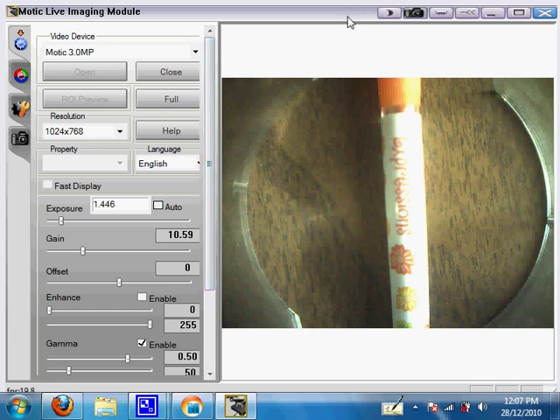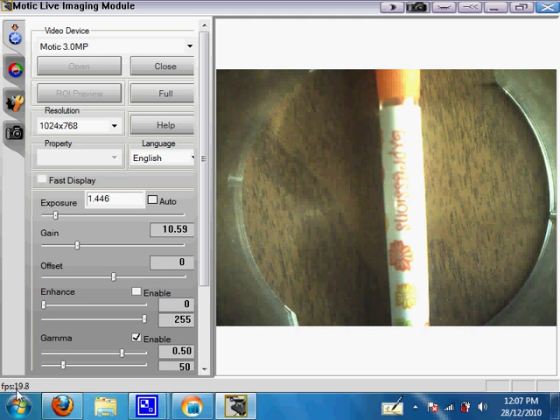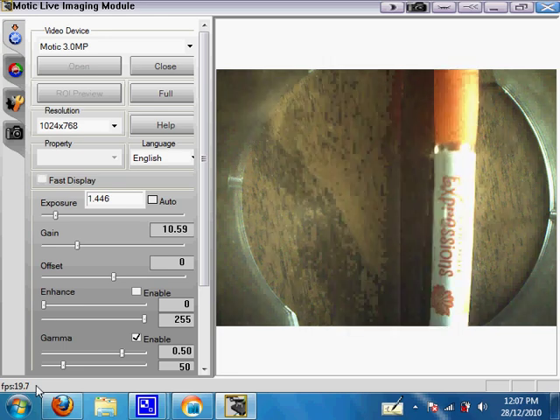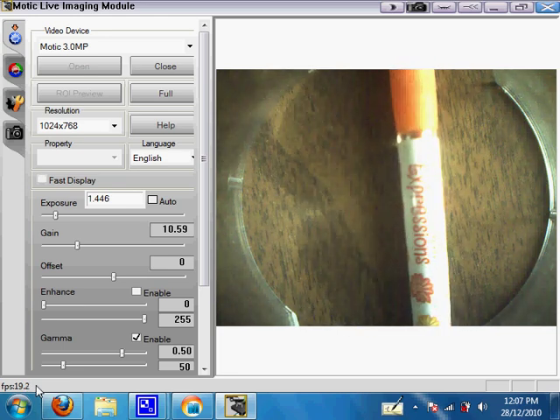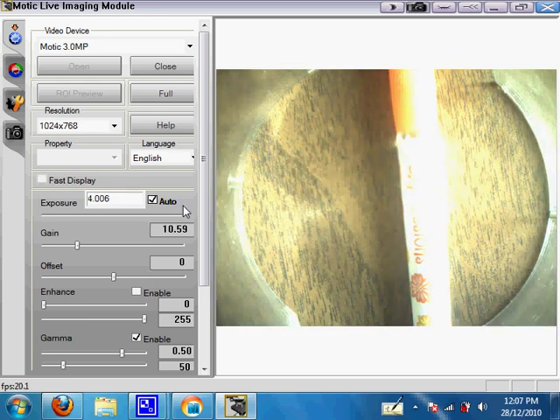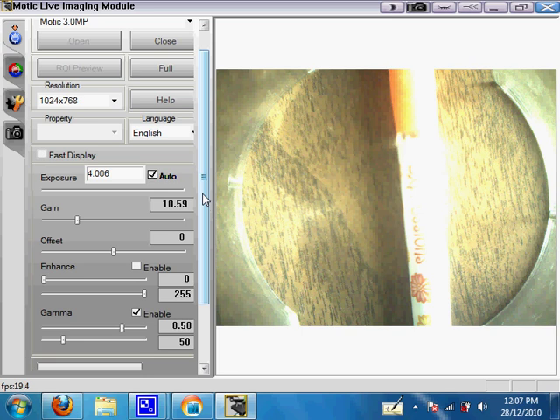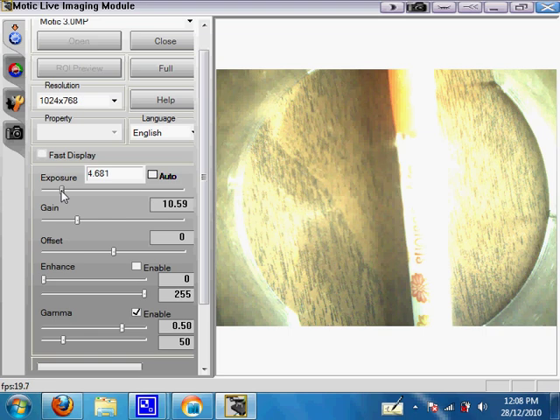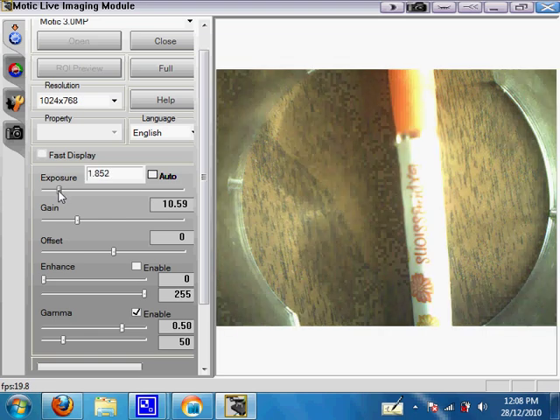Another thing to note is the FPS at the bottom. If your frames per second is higher than 0.0, your camera is connected to your software. Right now I'm getting 19 frames per second, which is a very smooth video. To get a smooth video, first go to Auto Exposure, which lets the computer decide how much exposure to use. If the image is overexposed and too bright, you can manually lower the exposure and everything will come back into view.